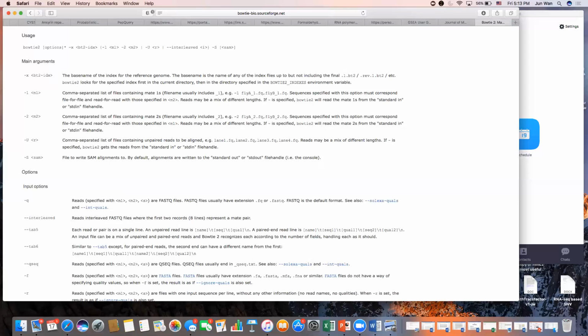Then the number -p 9, it's the number of threads. A small -x refers to the index. This is the next thing that I'm going to teach you on the Bowtie 2 page. Indexes are really critical, and I built a couple of them for you, and trust me, you're going to want to do this the way Dr. Sheng Lu recommended to me. By the way, Dr. Sheng Lu, you're amazing. I thank you for all of your help this week. If you guys have not met Dr. Sheng Lu, please meet him.